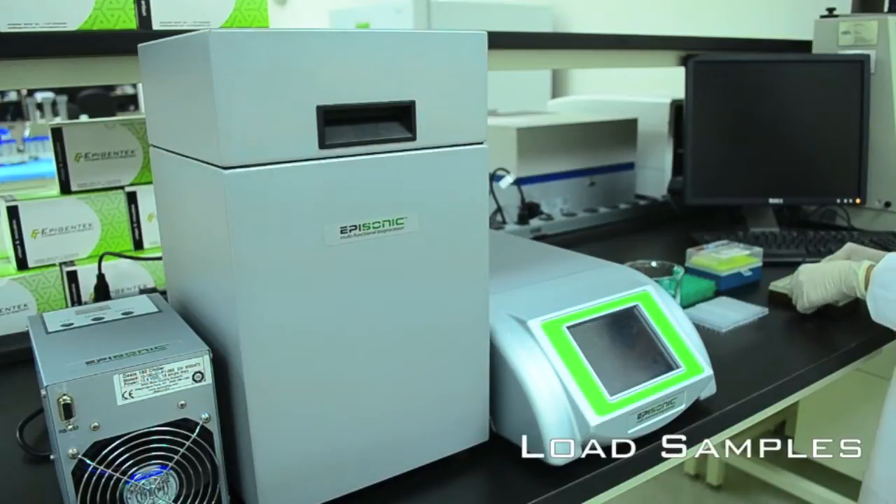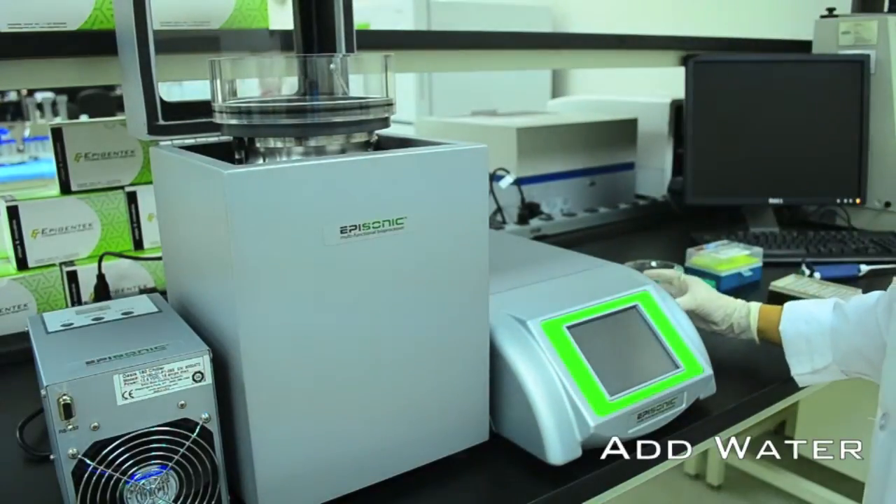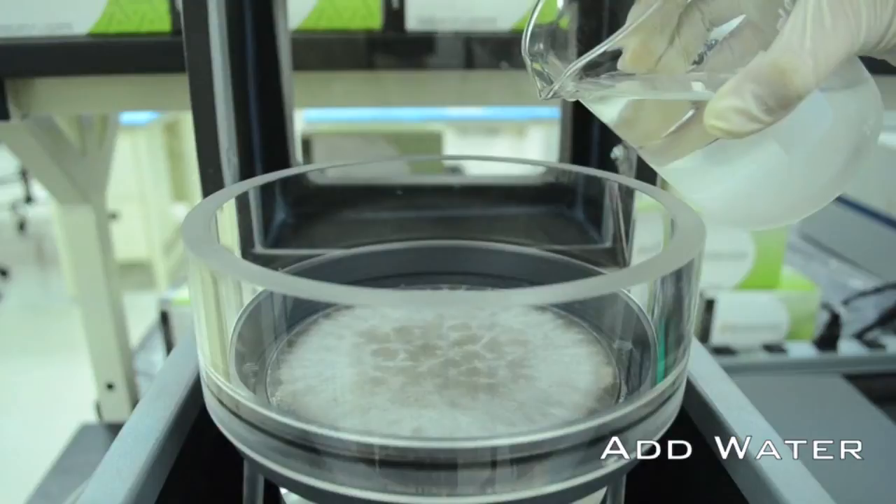To use the Episonic, begin by preparing your samples and loading them into common PCR tubes. Next, add water into the reservoir of the sonication processing horn.